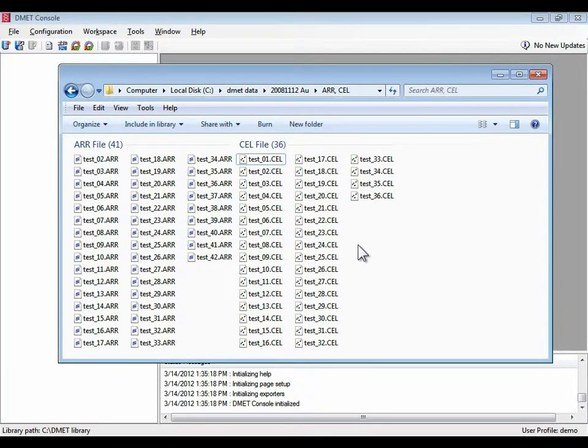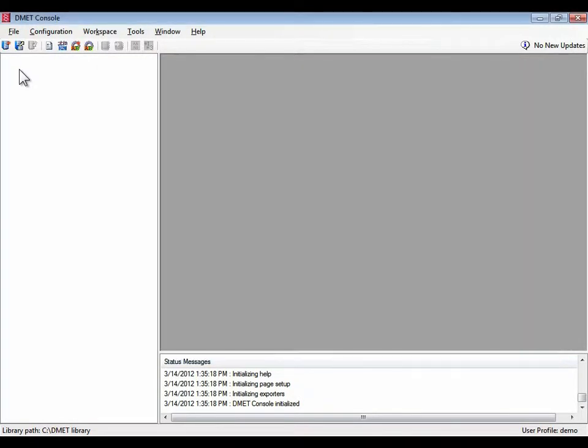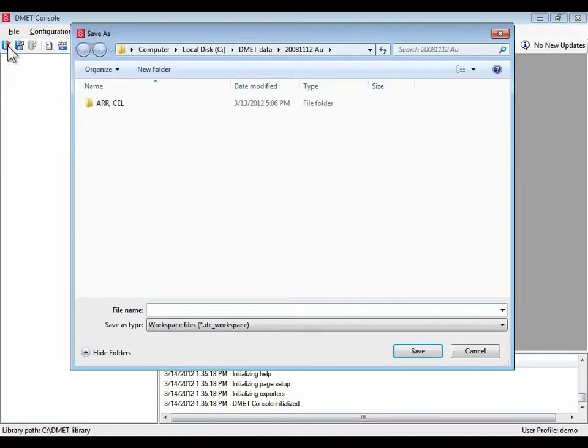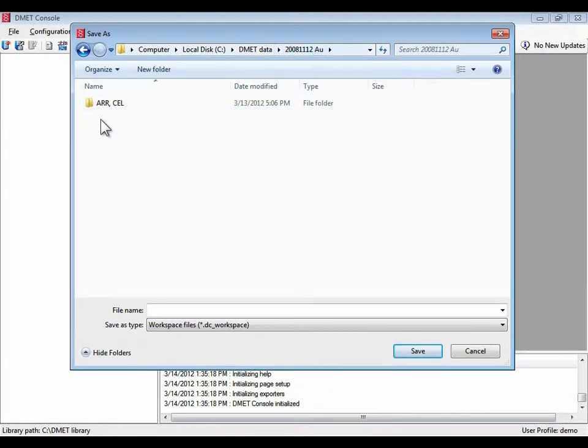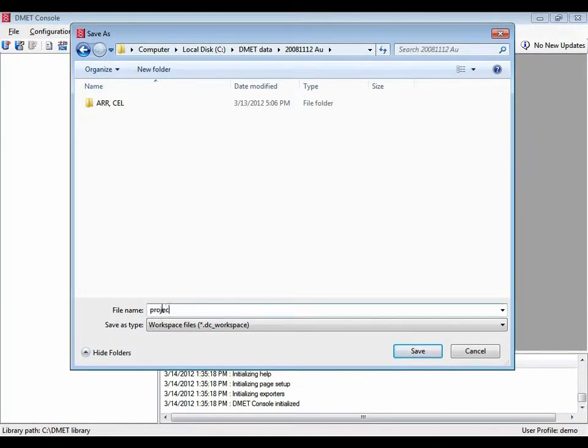So let's just get this data into DMET Console. We're going to create a workspace, which is basically a file that is used to store the collection of files that you want to work with. We're going to save our workspace in the same folder as the project where we're storing our data. We're going to save it, project one.